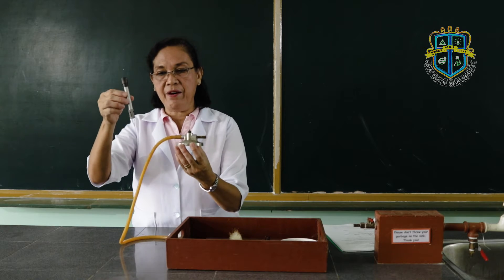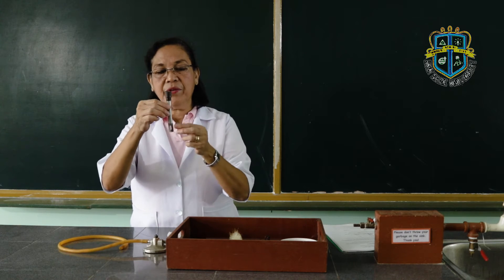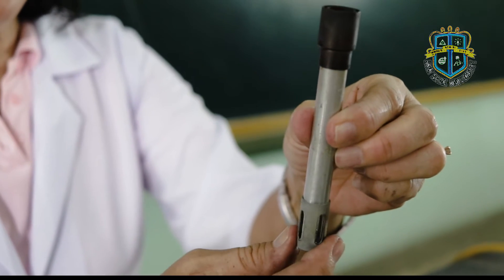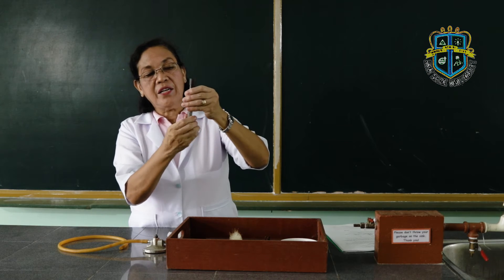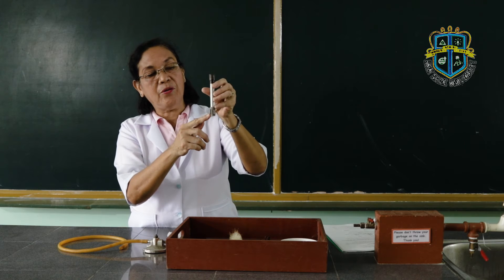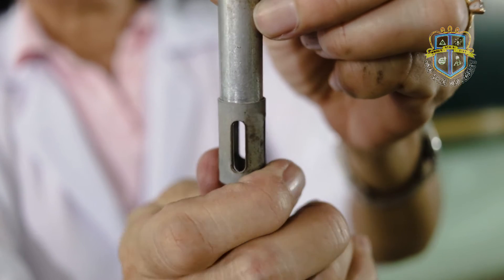There are two main parts: we have the barrel and we have the base. Onto the barrel — this is the barrel — you have here attached the collar. This collar can be adjusted. Onto the barrel, there are also air holes through which the air passes.